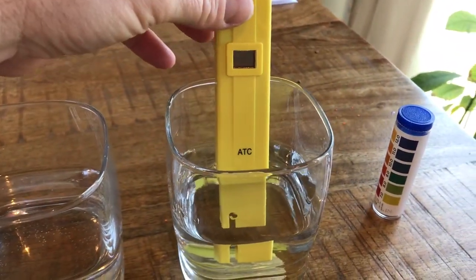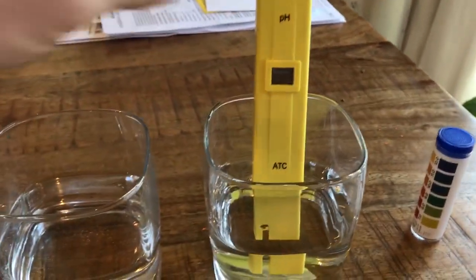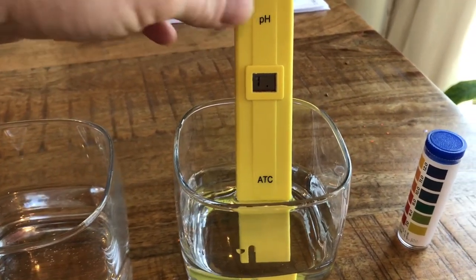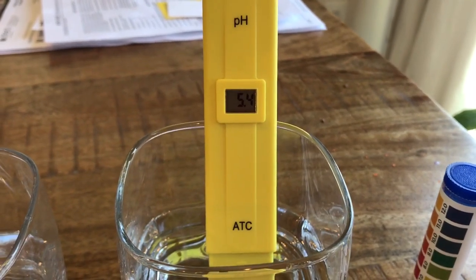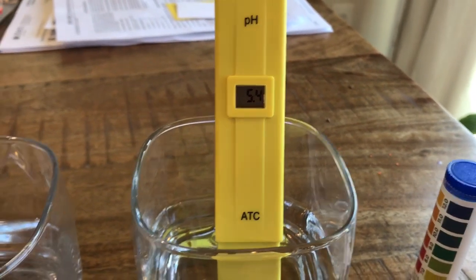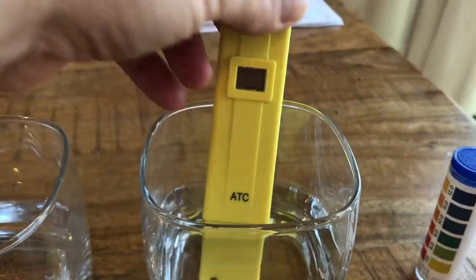Now this is distilled water — bought it from the store, steam distilled water — and my thought was this should read 7. As you can see, we have 5.4. That's what drove me nuts.